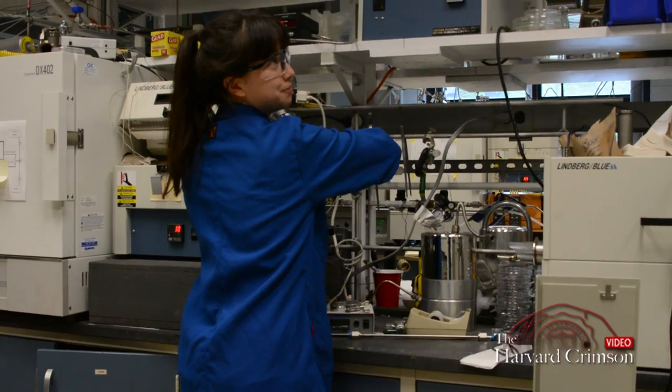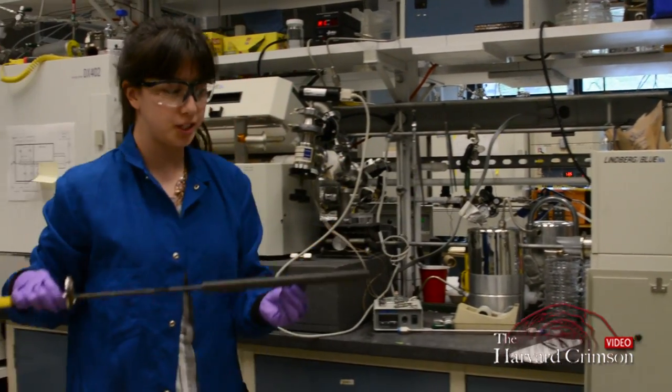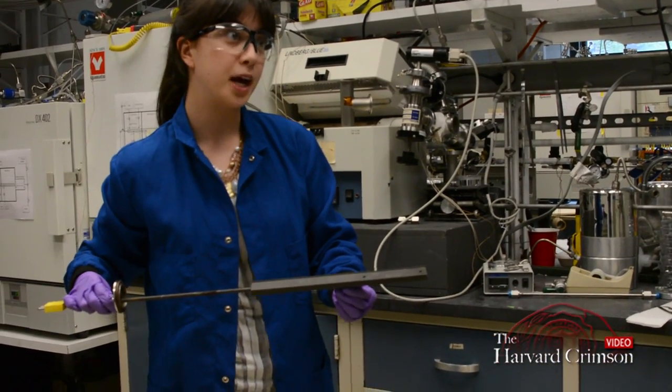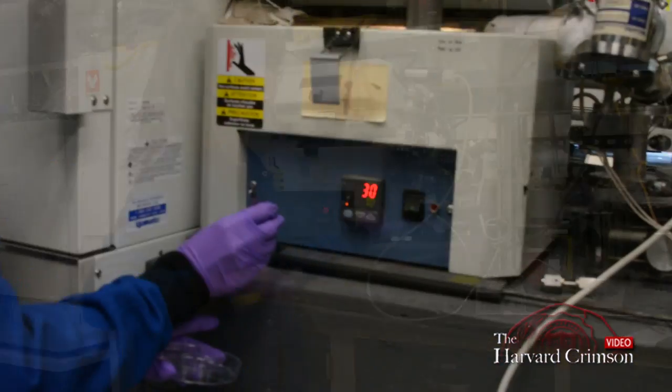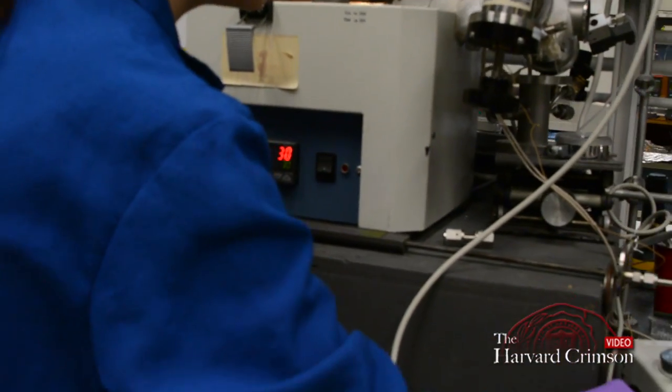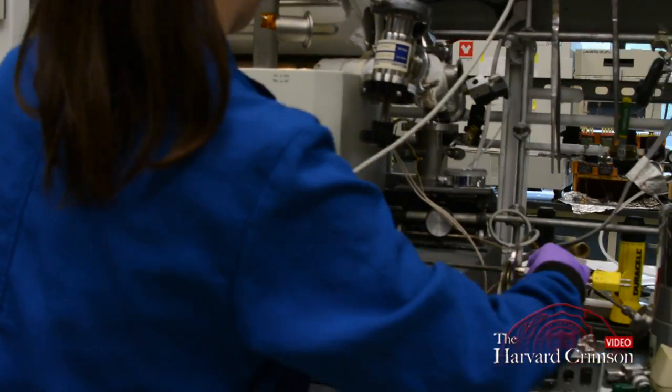It's called a tube furnace. So I'll open it up. And there are no solar cells on here right now. But what I'll do is I'll take blank glass, for example, and I'll place my samples onto the baking sheet and then put them in the oven.